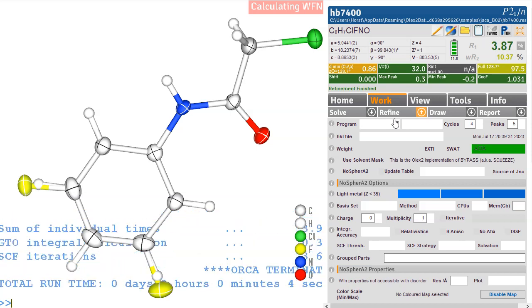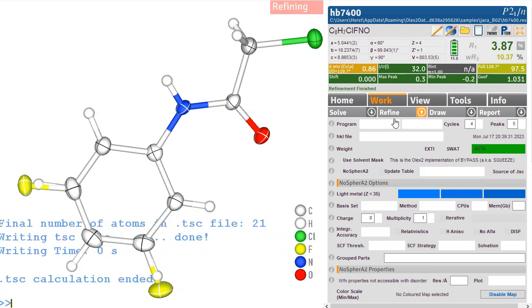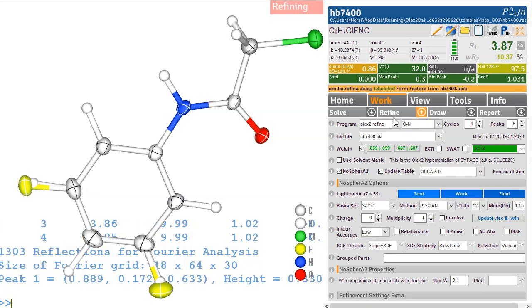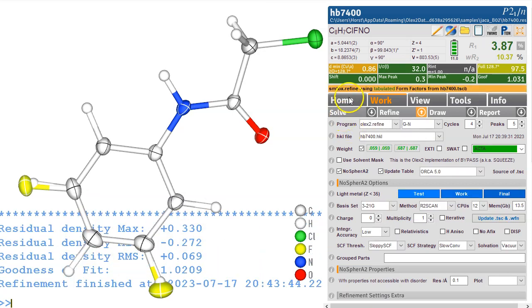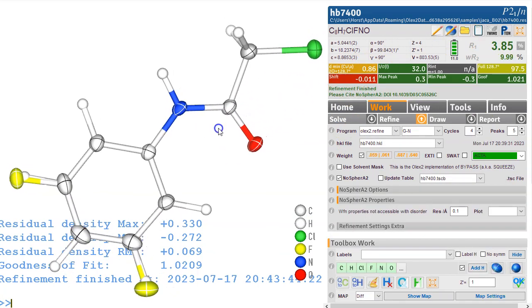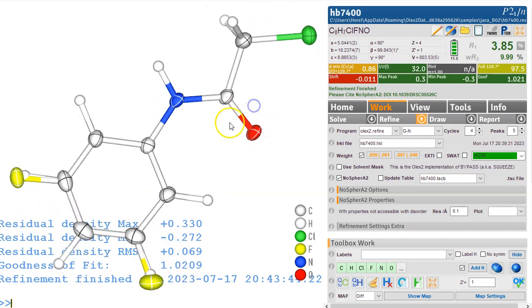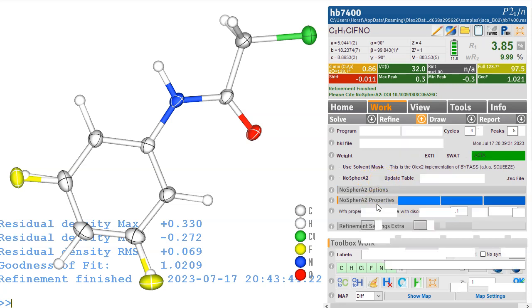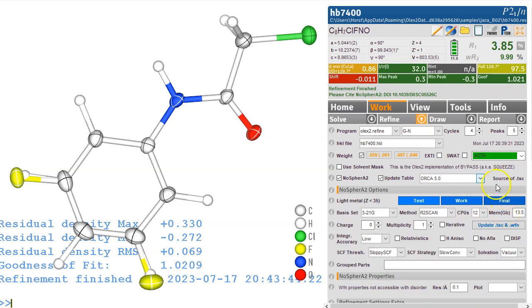Right, so this takes a little time, it's quite fast really, four seconds, and now we have the refinement and we have a structure just like before. The r factors is very very similar here. What we haven't done really is a, well we need to update that table because now we've got new atomic positions, a new model, we need a new wave function and we select slightly higher data, higher basis sets and so on.